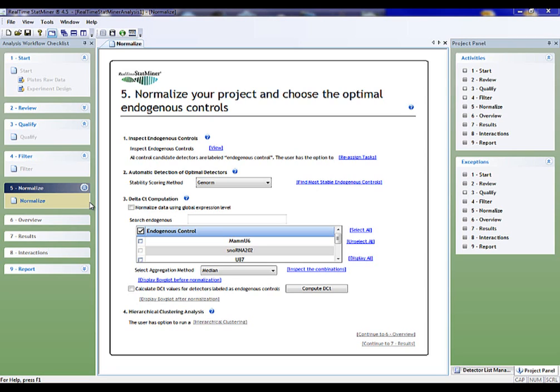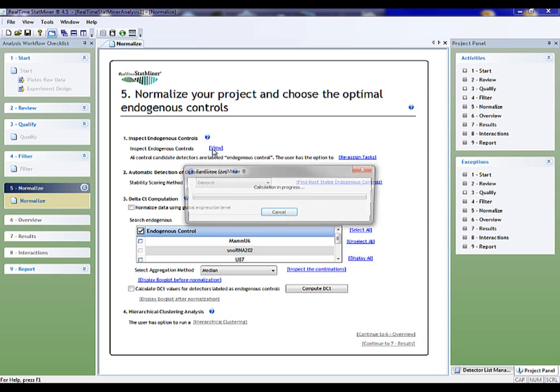This tutorial focuses on an important quality step prior to the classification and differential expression of the analysis. The delta-CT normalization standardizes the differences in nucleic starting material in our samples, something that is essential for comparing our biological groups. To do that, we normalize our data using a set of endogenous controls that maintain their expression levels despite different experimental conditions. Here are the reports we get after click-and-go execution.